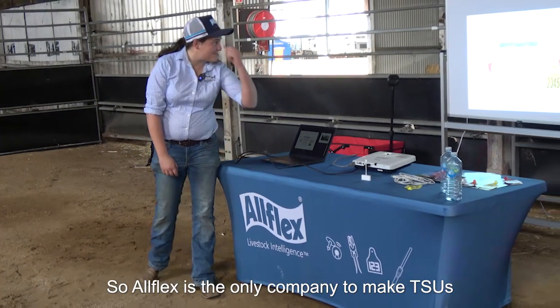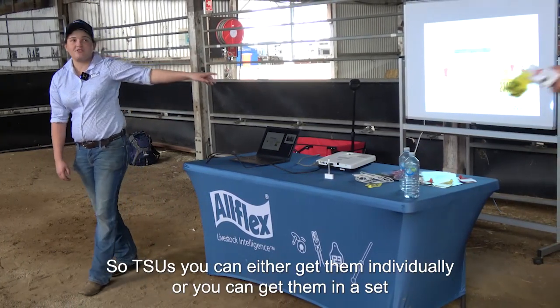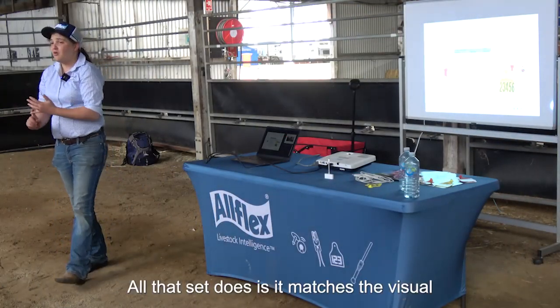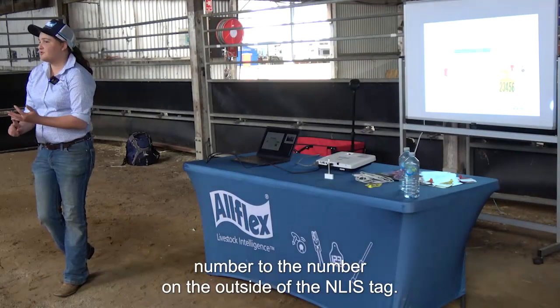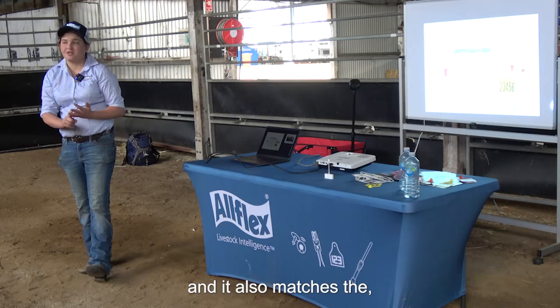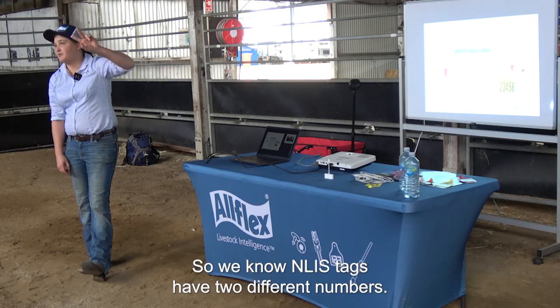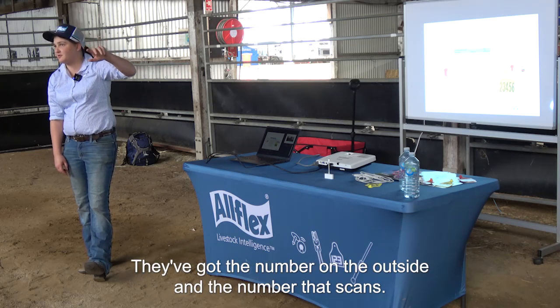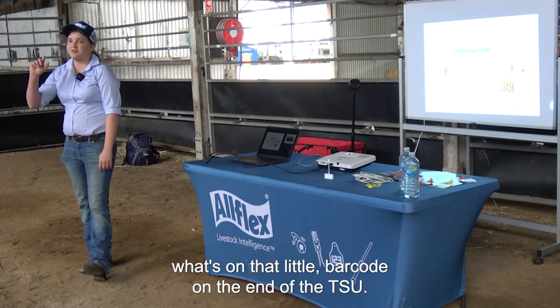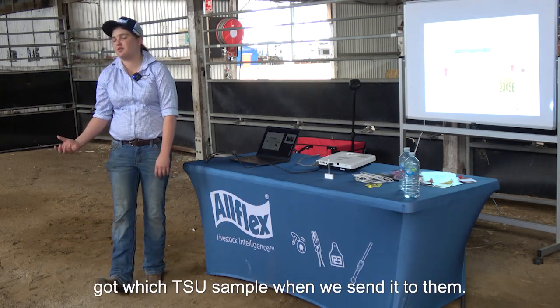So Allflex are the only company to make TSUs, and this is just a little bit of an explanation on the numbers. TSUs, you can either get them individually or you can get them in a set. Has everyone seen those sets? All that set does is it matches the visual number to the number on the outside of the NLIS tag. That's the NLIS ID. And it also matches the electronic number. So we know NLIS tags have two different numbers. They've got the number on the outside and the number that scans. So the scanned number, or the RFID number, is what's on that little barcode on the end of the TSU. And that's how the lab knows which animal got which TSU sample when we send it to them.